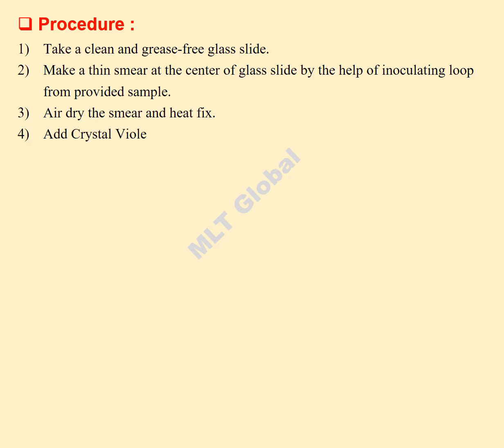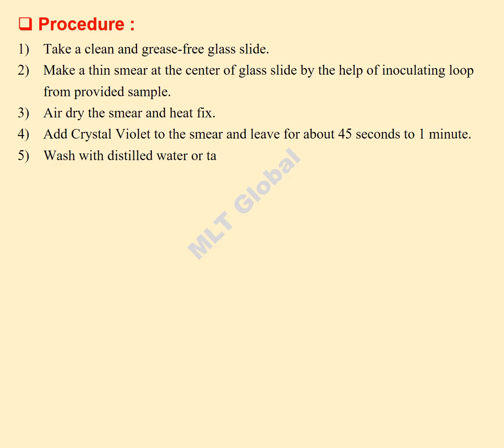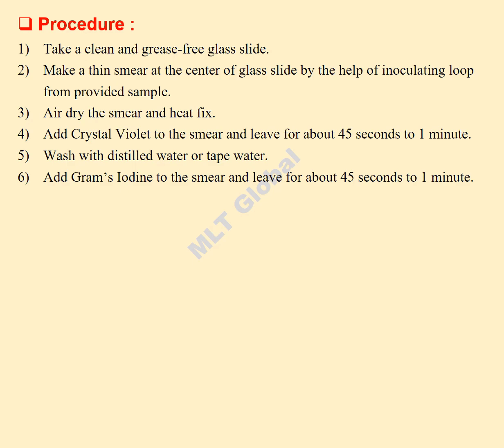Add crystal violet to the smear and leave for about 45 seconds to 1 minute. Wash with distilled water or tap water. Add gram's iodine to the smear and leave for about 45 seconds to 1 minute. Wash with distilled water or tap water.